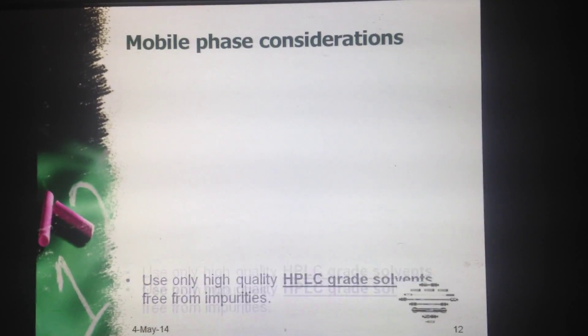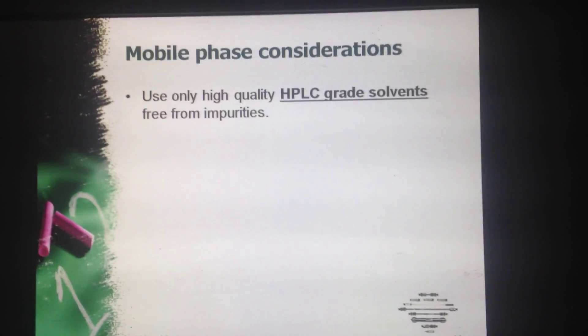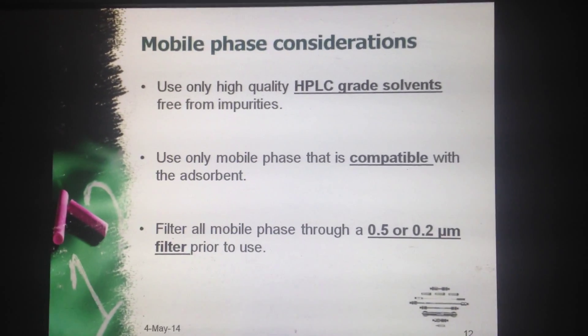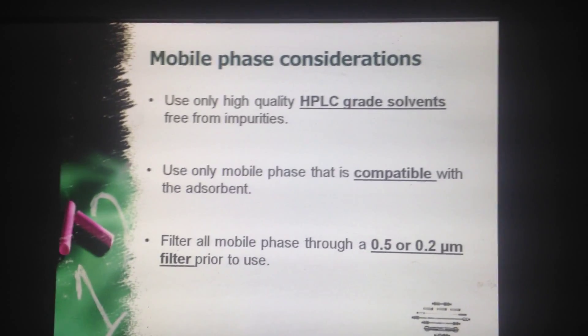Now what are the mobile phase considerations? First, use only high quality HPLC grade solvents free from impurities. Second, use only mobile phase that is compatible with the adsorbent. Third, filter all mobile phase through 0.5 or 0.2 micron filter paper prior to use.